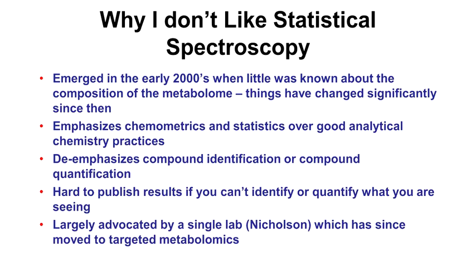Most of the field of statistical spectroscopy grew out of work that Jeremy Nicholson pioneered, especially in the area of metabonomics and toxicology. And many of the people who worked in his lab have largely adopted it. But even the original lab that started it has now largely moved to targeted metabolomics using spectral deconvolution or targeted MS, where compounds are identified and quantified first before the statistical tests are applied. So with that, that's my story on statistical spectroscopy.